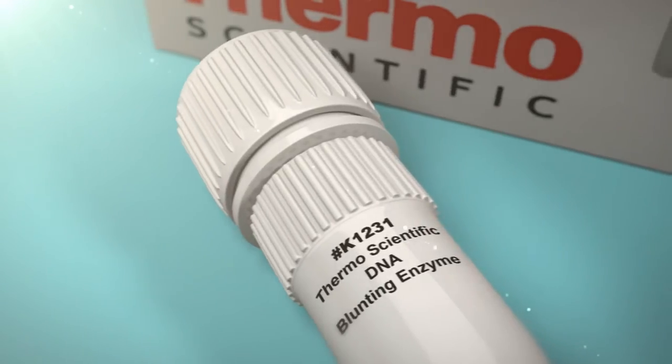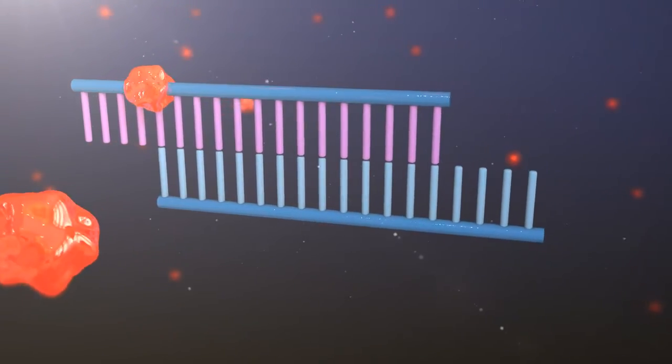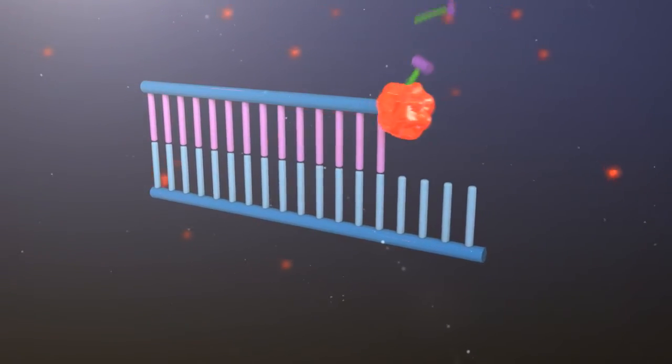For this purpose, the kit includes a proprietary DNA blunting enzyme that removes three prime overhangs and fills in five prime overhangs using the nucleotides included in the reaction buffer.